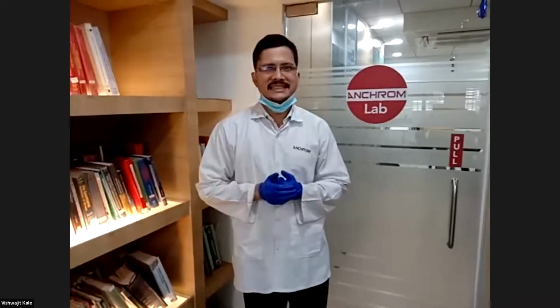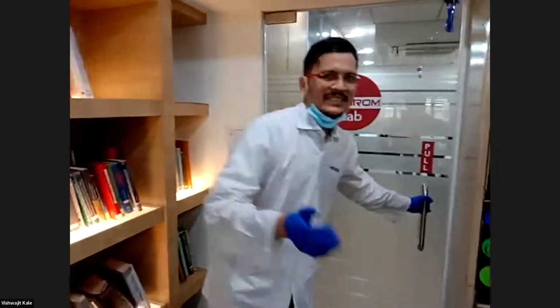Yes, because literature survey and sample preparation are the key factors before any chromatographic or spectroscopic analysis. We have to do a proper literature survey, to see whether any method is already available in the literature that we can use. We can check the solubility using the Merck Index, etc. Without proper sample preparation, whatever we apply on the plate or insert into the chromatographic system, we can separate molecules only from that sample. So we need to enrich our samples and prepare them very properly so that we get the final results in a fine way.